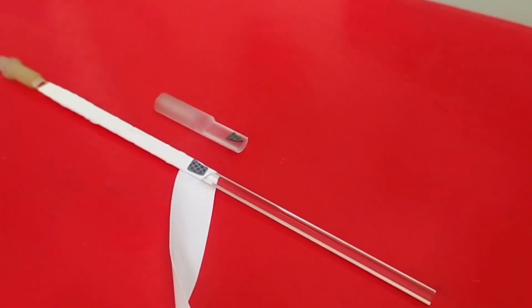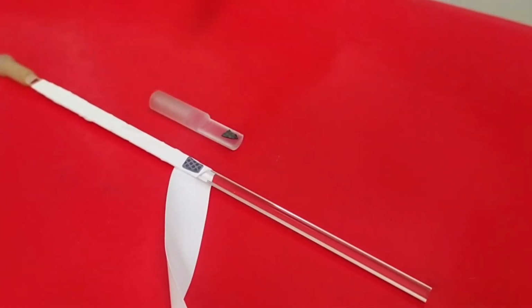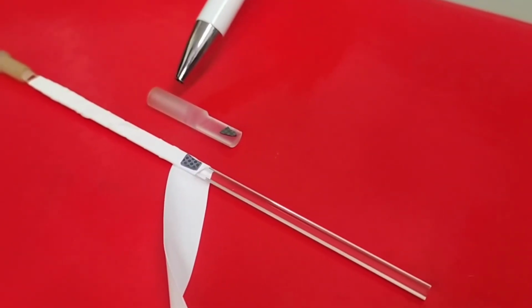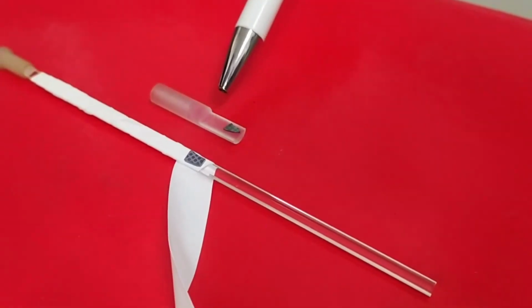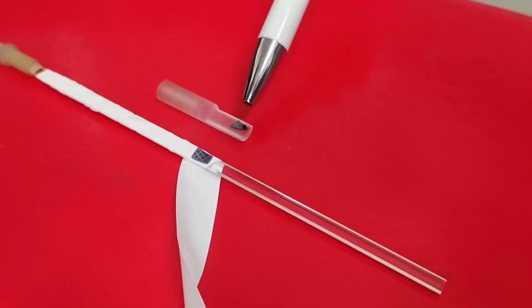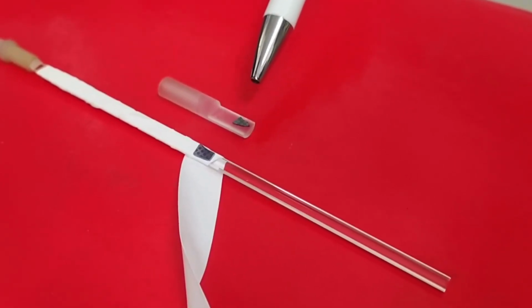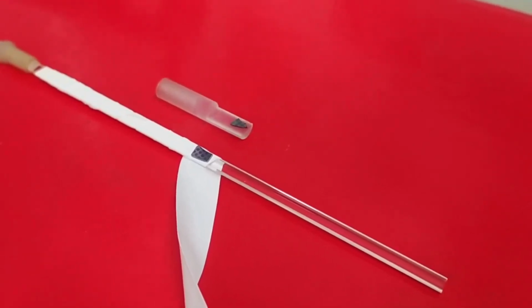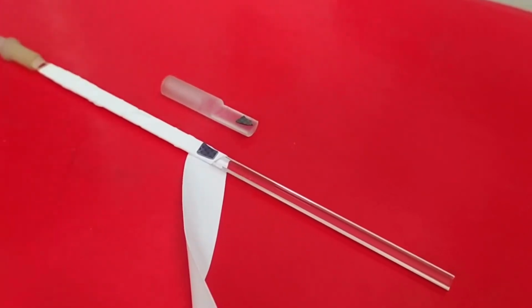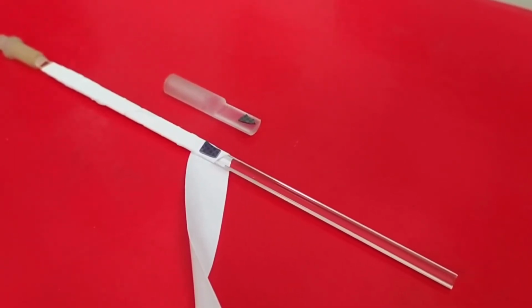Especially when high sensitivity is required, the way you mount a sample is extremely critical. This is the way you mount a sample on a typical vibrating sample magnetometer. This is the sample holder that we examined before, and your sample, the thin film in this case, is placed here at the end of the sample holder with a small drop of silicone grease, of vacuum grease. But as we discussed in the theoretical part, the problem is that every interface, every discontinuity in the materials that go inside the gap of the magnet brings a magnetic signal that affects the measurement.